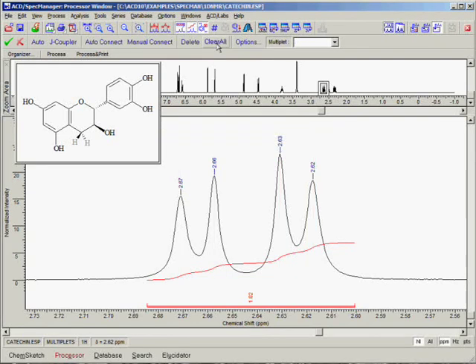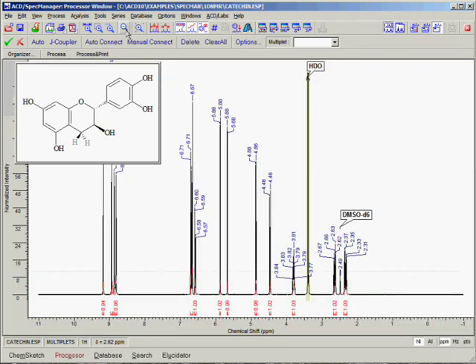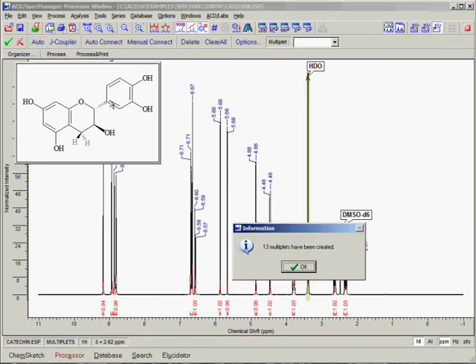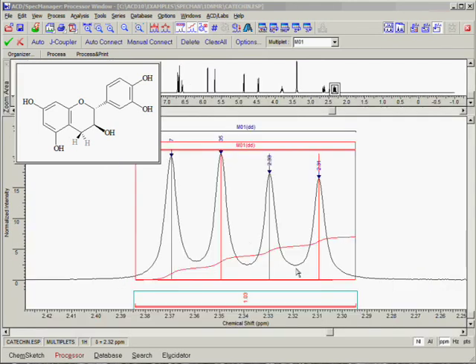We may also want to zoom out to see the entire spectrum. Now notice that the first button available on this toolbar is the Auto button. By clicking this button, we will produce a complete set of multiplets for this spectrum automatically. The dialog box that appears shows us how many multiplets were created by the automatic procedure. If the Auto Zoom feature is enabled, you will be taken automatically to the first multiplet when you click OK.